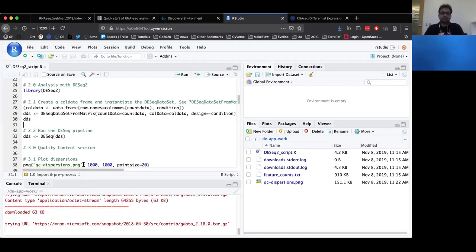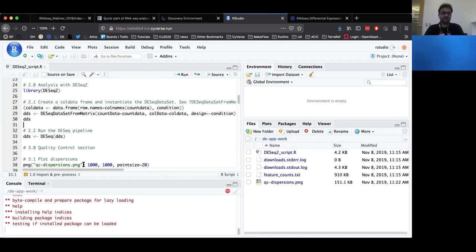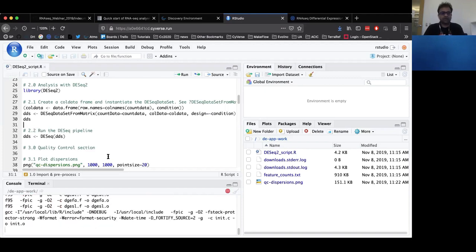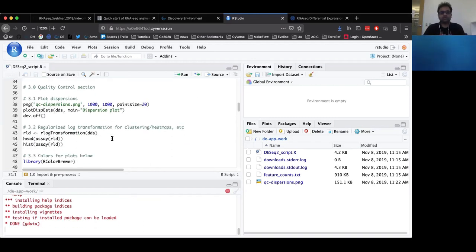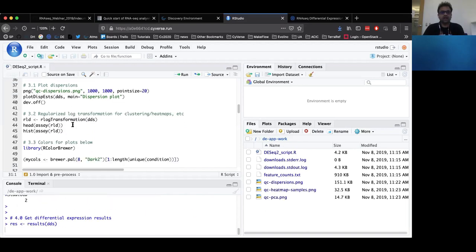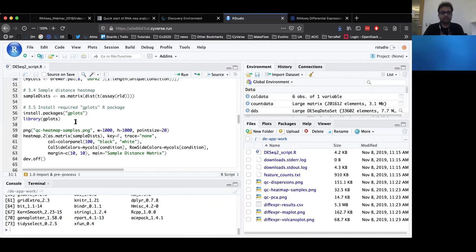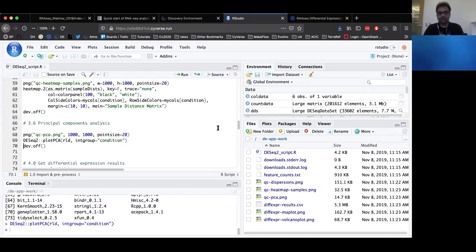Once you run the DESeq2 pipeline, we also have a quality control section where you can look at the dispersions of expression for your counts. You can look at a heatmap of samples based on unsupervised clustering — that is a measure of how well your biological replicates are grouping together, which is very important information to assess how good your samples are. You can also do principal component analysis, which will tell you again how good your samples are.